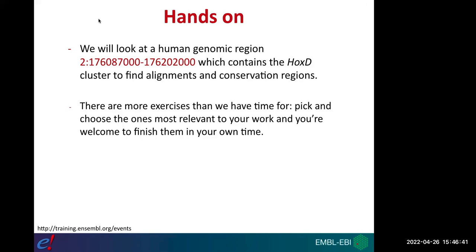Hello, everyone. It's just gone 4:45. So I wanted to bring us all back together to see if there were any final questions before we finished for today. So there is one question in the chat box that came in just a moment ago. So I was planning on answering this together with everyone and then seeing if there are any final questions before we wrapped up. So Ricardo's asked if there's a way to obtain the alignment of all the paralogs of a gene, something that looks like the Wasabi alignment that they've found in the browser.